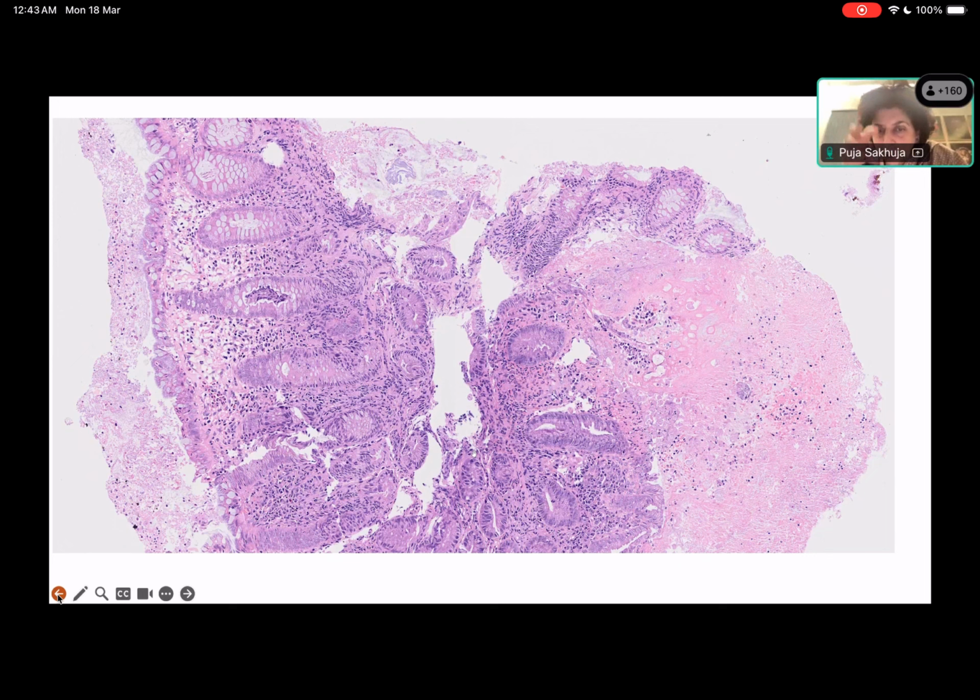Of course, when there is a pathology, there can be loss of goblet cells. So definitely it becomes a bit problematic sometimes when there is a lot of inflammation. But by and large, you should know if there are no Paneth cells or just an occasional Paneth cell, then it is not likely to be from the small intestine, right?